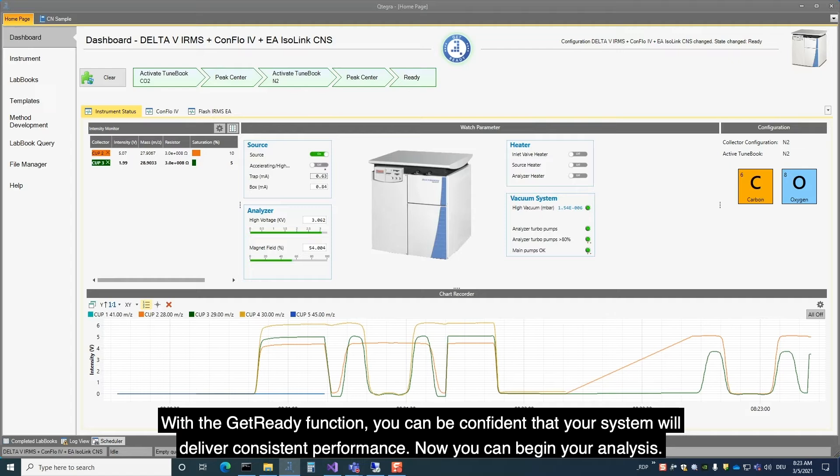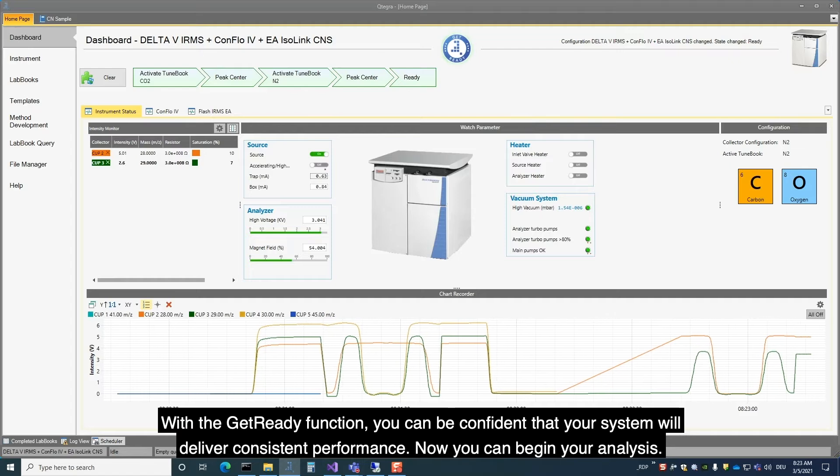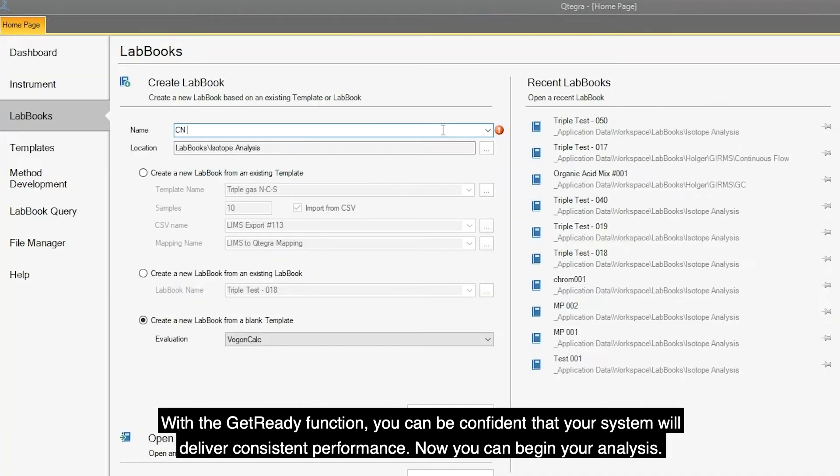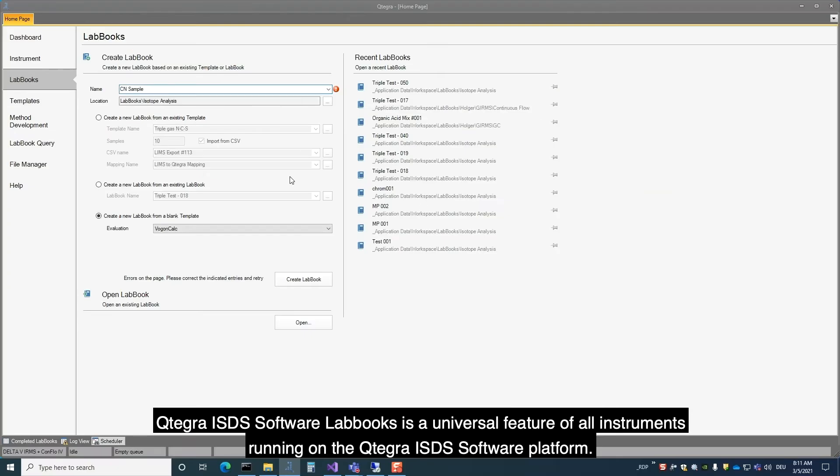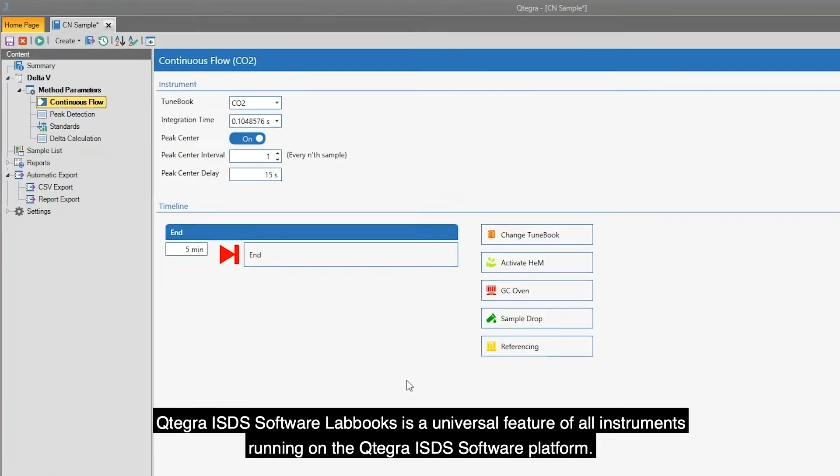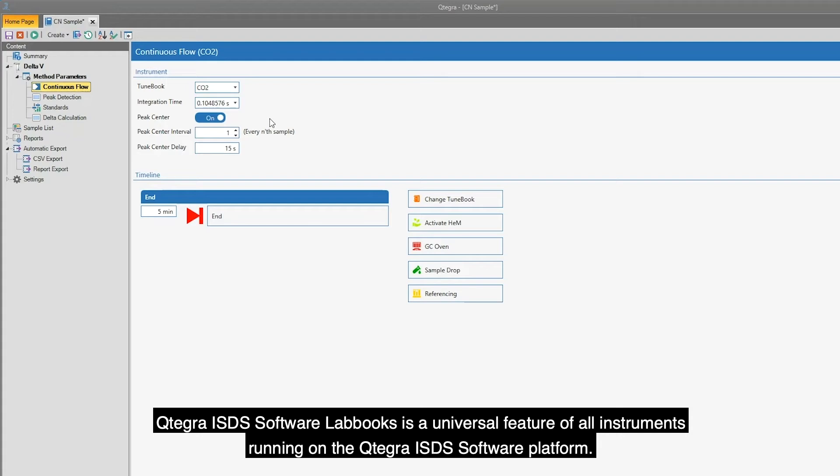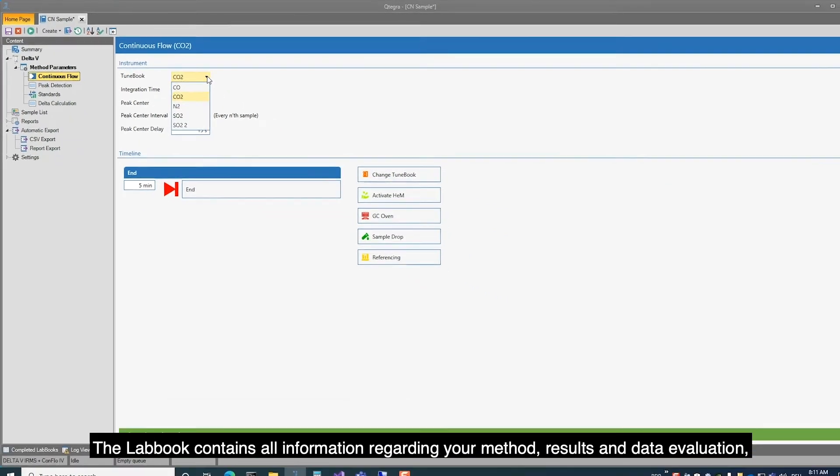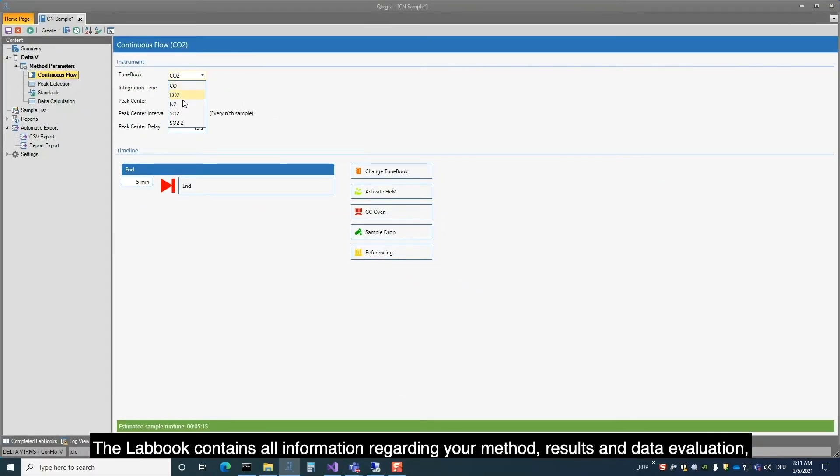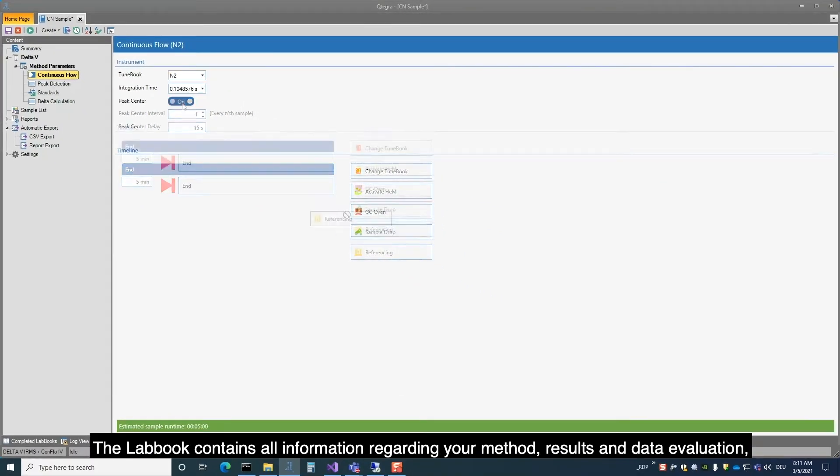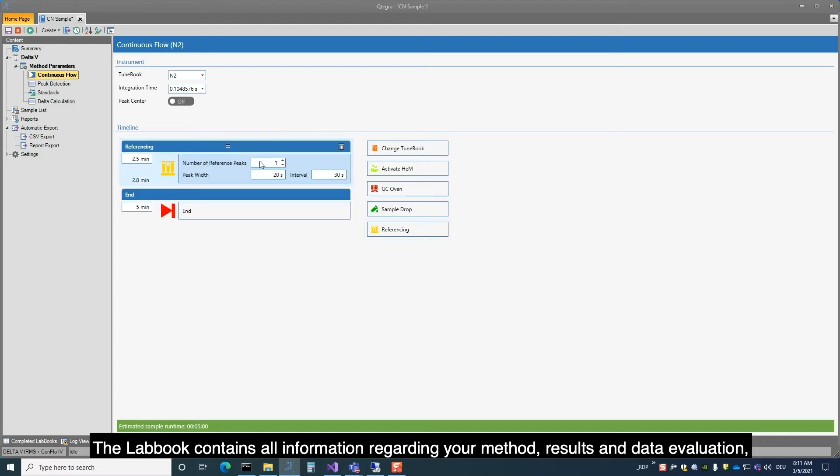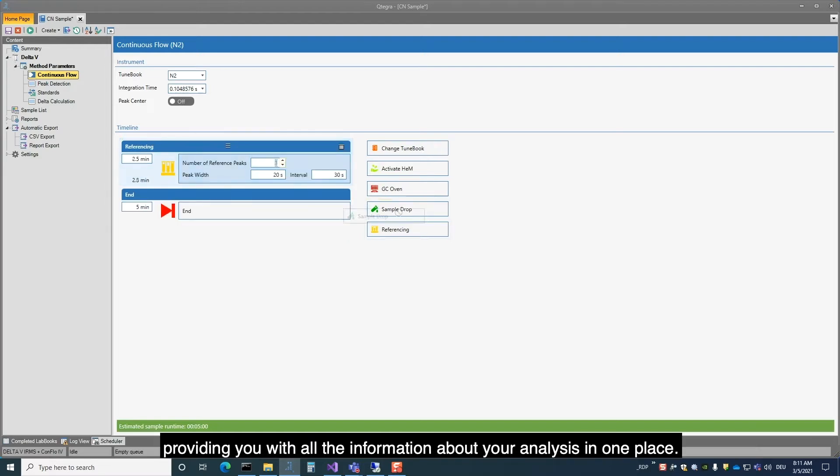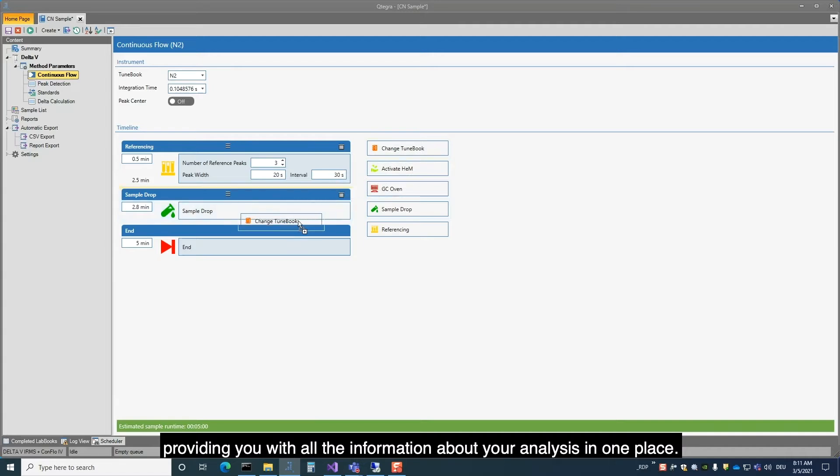Now you can begin your analysis. Qtegra ISDS Software labbooks is a universal feature of all instruments running on the Qtegra ISDS Software platform. The labbook contains all information regarding your method, results and data evaluation, providing you with all the information about your analysis in one place.